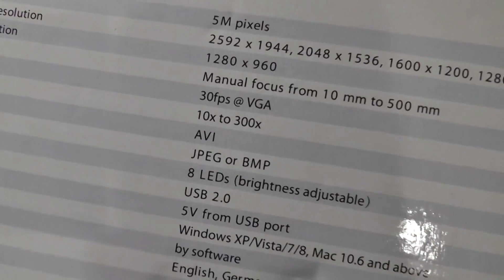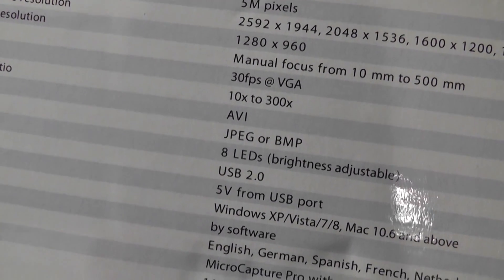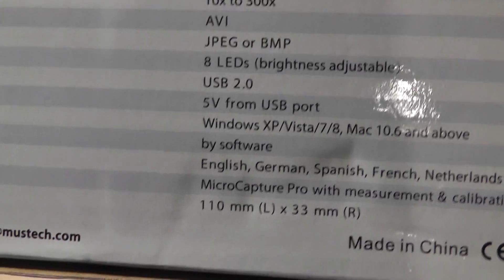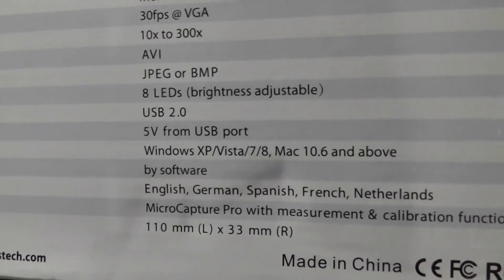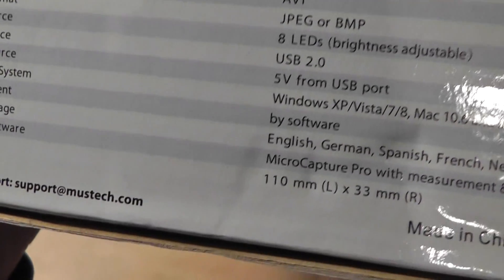On the back is some more information about the specifications, including the capture rate — it's 30 frames per second at VGA quality. Images are up to 8 megapixels, so relatively high resolution. 8 megapixels is going to be a bit more than the 5-megapixel advertised rate, but it's also going to lose some of the finer details.